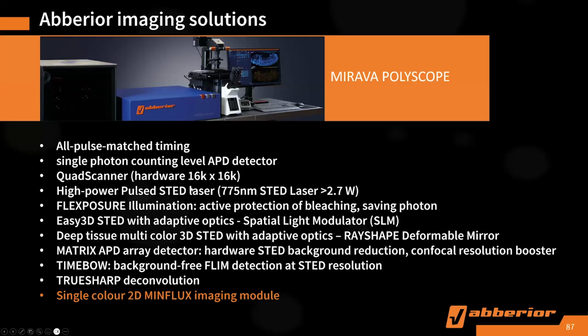So the last part is MINFLUX. I will only give a very brief introduction because we are going to explain MINFLUX on Thursday. So on the MIRAVA, we can do single color 2D MINFLUX imaging. While on the giant MINFLUX, you can do 2-color 3D imaging and tracking. Okay?